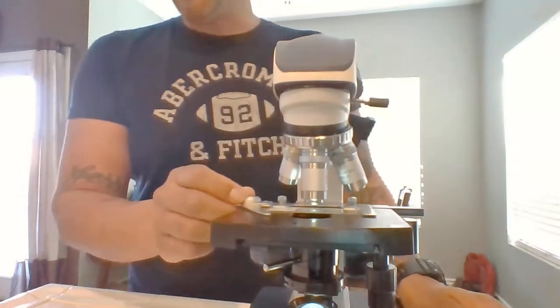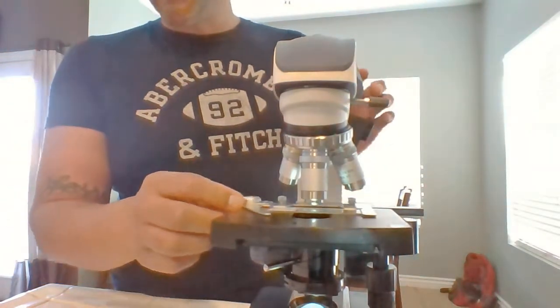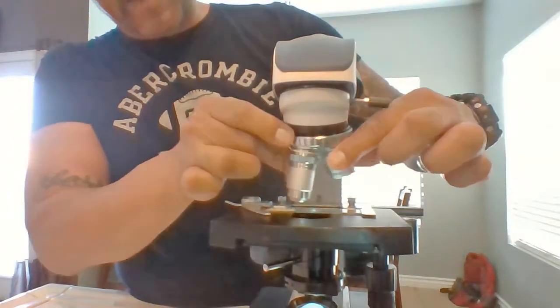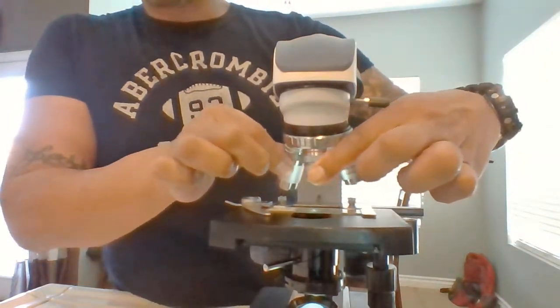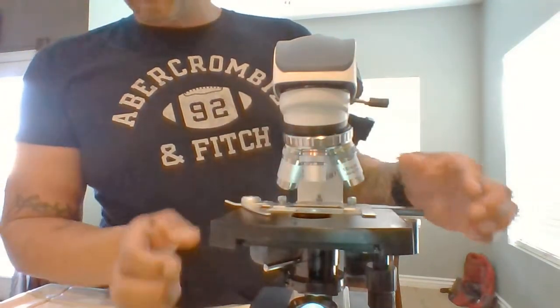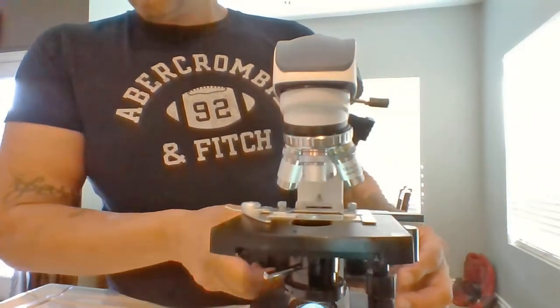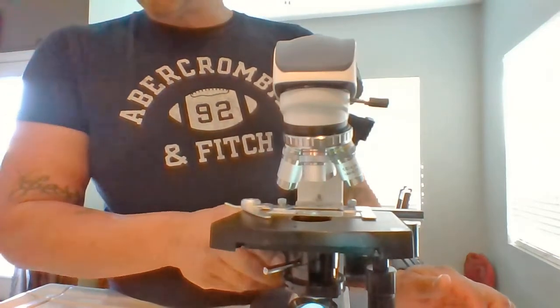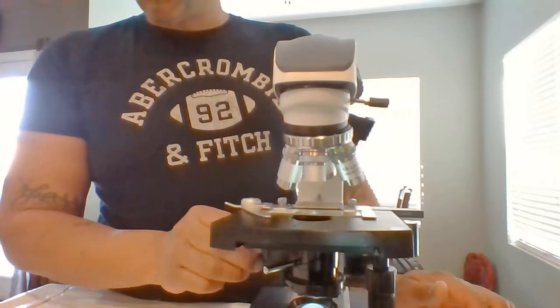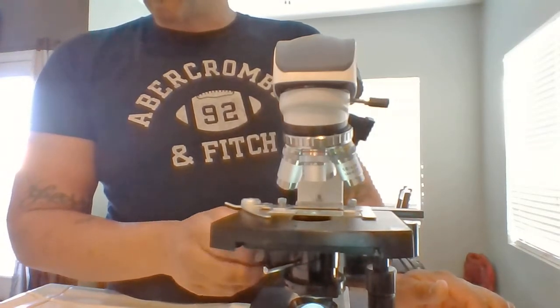I'm going to place the slide here on the stage, and it will be held in place by the stage clips here, starting with the lowest power magnification. I'm going to use the coarse adjustment here until I see the specimen in the field of view, and then I will use the fine adjustment to sharpen the edges for a clean view of the slide.